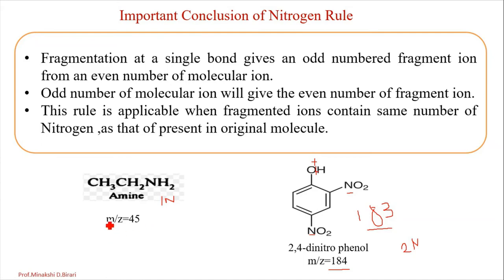But on further fragmentation, cleavage occurs at the carbon-carbon bond, so there is formation of a methyl radical, and the other fragment, the cation CH2=NH2 plus.